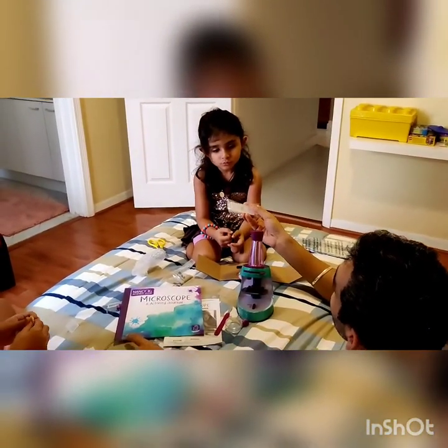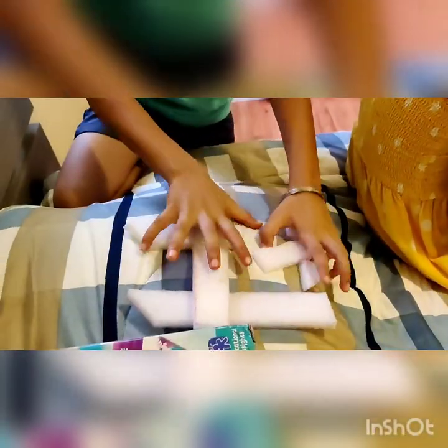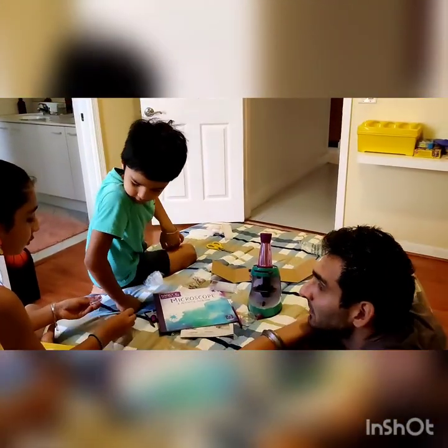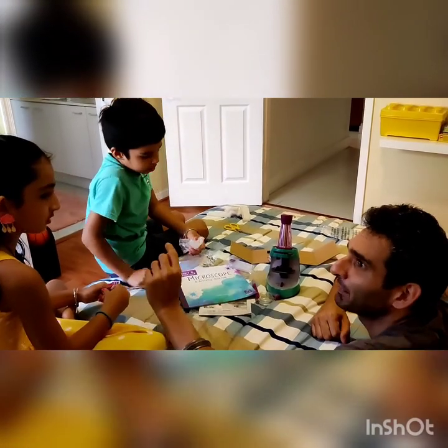These are slides. On top of the slide, we put the onion. Then we put the color drop. Then we put the cover slip that we have. Then we put the slide over here and look through it. But then what are these for? I think you keep some specimens or whatever.